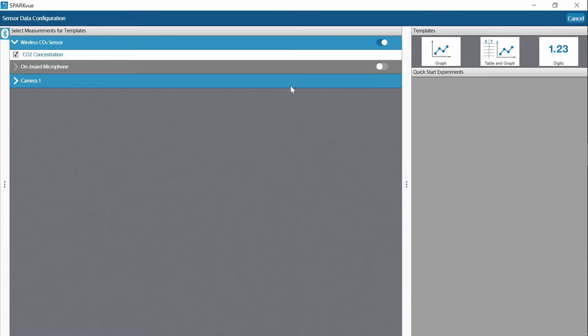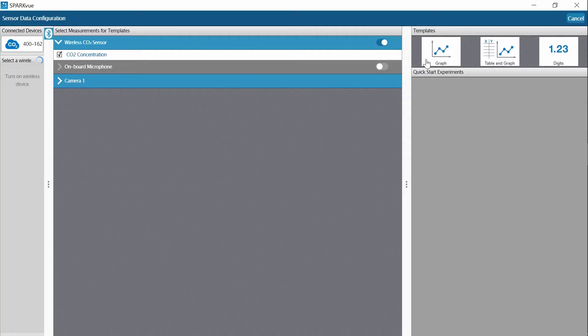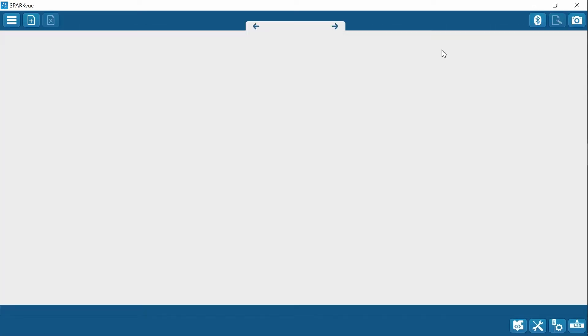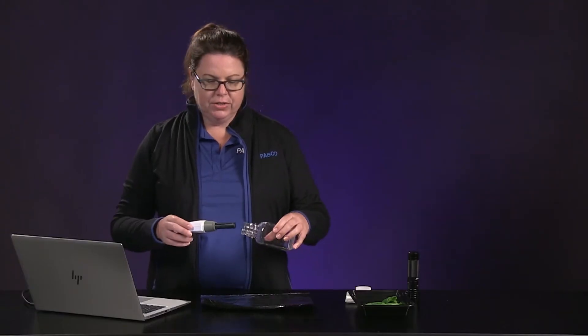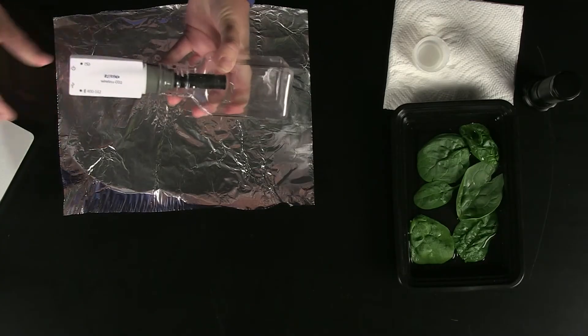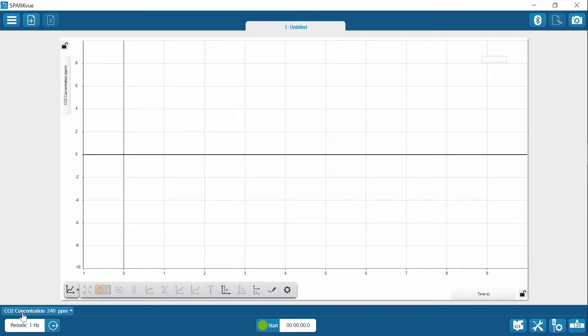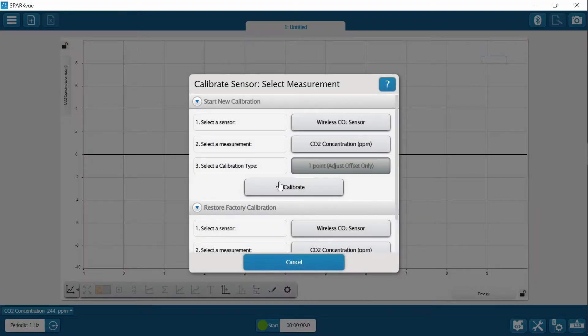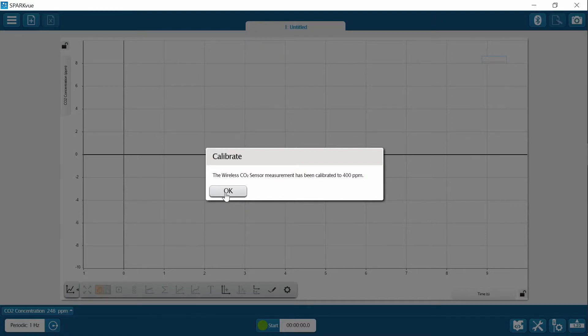To start, select Sensor Data in SparkView and make sure that your CO2 sensor is connected to your device. For this investigation, you'll want to choose the line graph display so you can see CO2 concentration over time. Before you get started, calibrate your CO2 sensor by putting it inside the bottle and clicking Calibrate Measurement at the bottom left. That's all you have to do — the CO2 sensor is now calibrated.